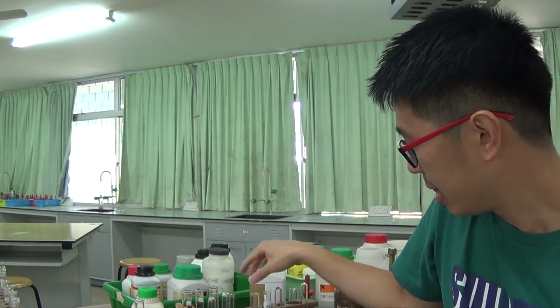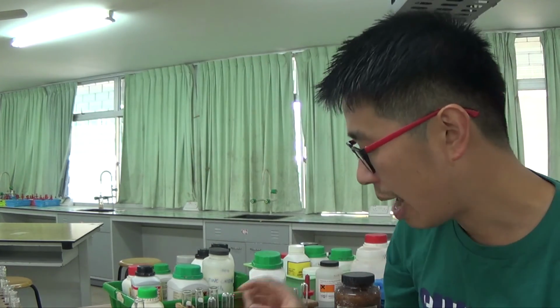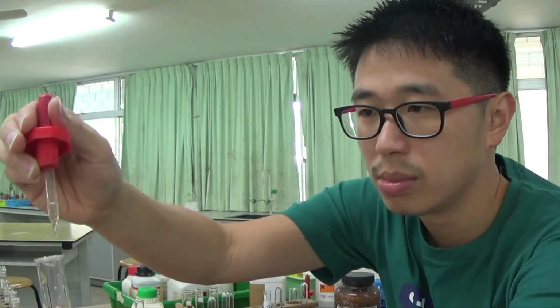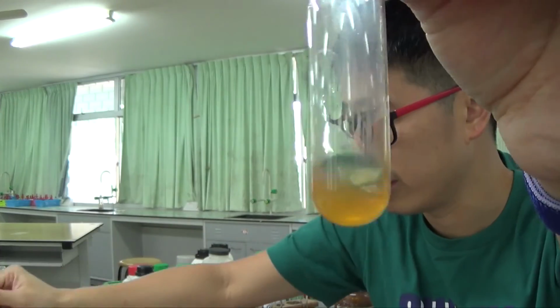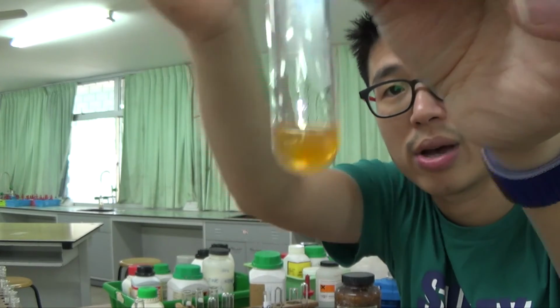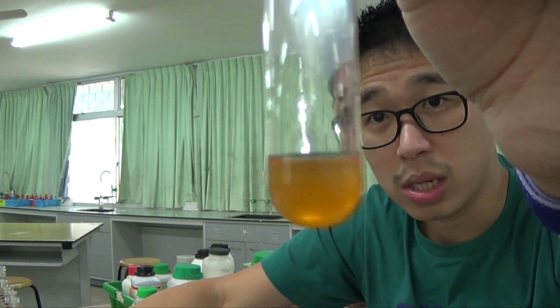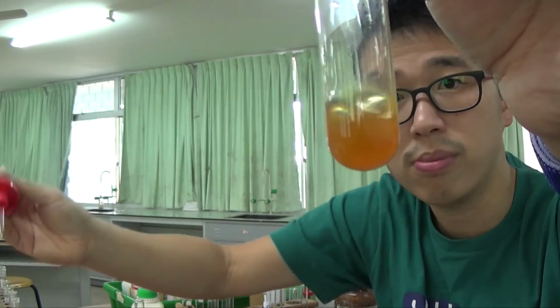Now to the other portion, this is also the solution, the clean portion. I'll add ammonia. I just remembered I didn't add ammonia to iron 2, but it's going to be the same result as sodium hydroxide actually. So I add ammonia. What happened to the solution? Do you see that it starts to become cloudy? That's because a precipitate has started to form.